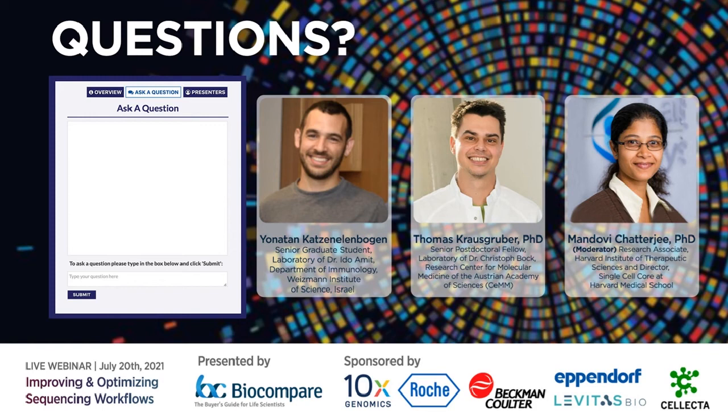One of the questions is, do you have recommendations on RNA-seq analysis platforms? Jonathan? We're using an in-house analytical platform, so I'm not that familiar with other things. It's called MetaCells, and the main principle is that it clusters together cells that look the same, and we're actually working with single cells.